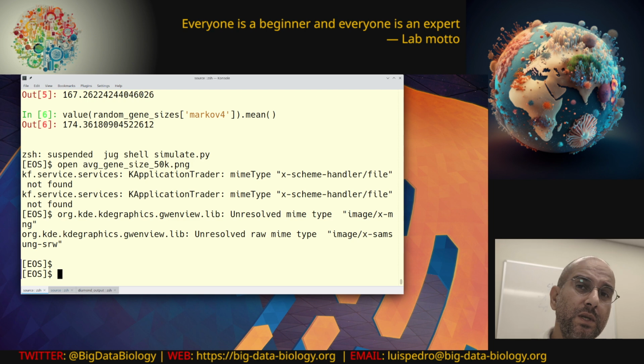We still see that there's a couple of things here. For a very small number of mutations, although maybe hundreds of mutations is not that small, we saw that there was already an effect that genes were messed up, but checkM2 was still not picking that up, and maybe we'll try to look a bit more into that.